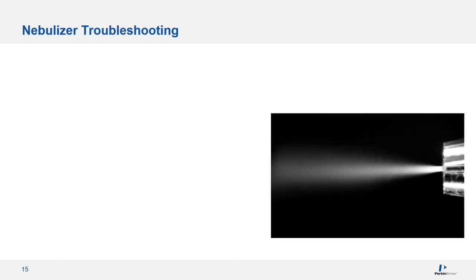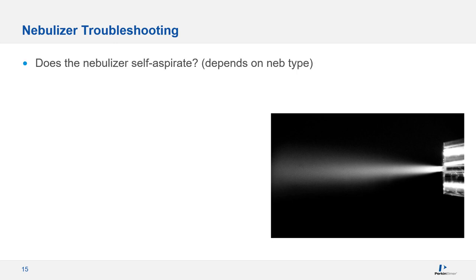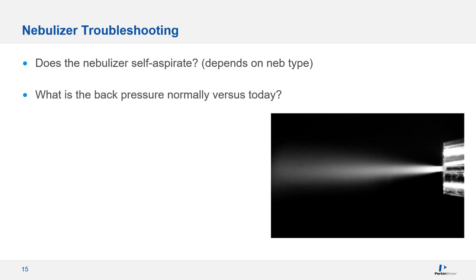So what about troubleshooting? All concentric nebulizers should self-aspirate, which means if you have the nebulizer gas flowing, liquid will flow through the tubing without pumping. If it doesn't, it's likely damaged or at least partially plugged. When you install a new nebulizer, you want to make note of back pressure. If you see it increase from that, it's an indication of plugging. If it's lower than expected after post-cleaning reinstallation, you may have a loose connection.